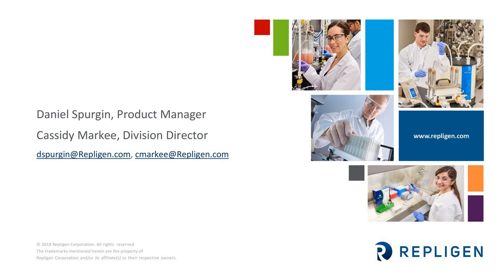Great. Thanks, Cassidy. So you offer closed systems and reduced sample handling. How are membranes prepared for use?